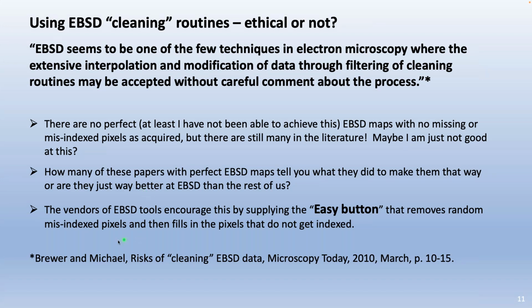how they made their EBSD map so nice. The vendors of EBSD tools encourage this somewhat by supplying what I call the easy button. It removes random misindexed pixels and then fills in the pixels that do not get indexed with various routines. Some of them quite defensible, some of them I think a little bit questionable.